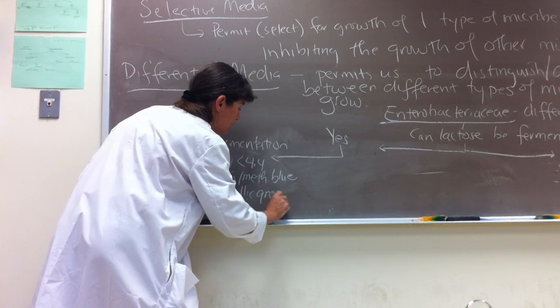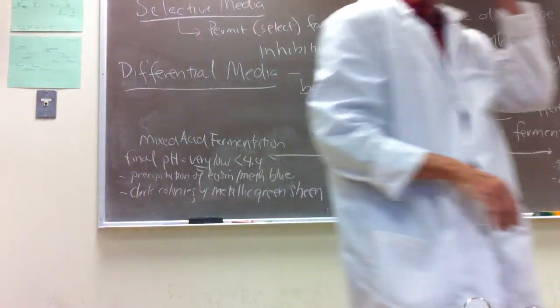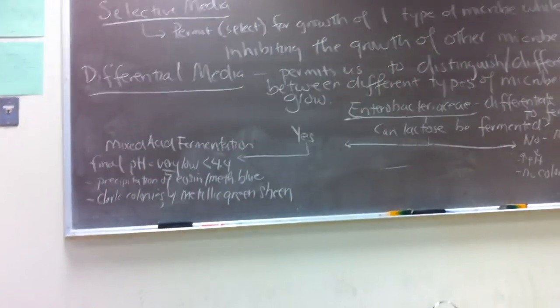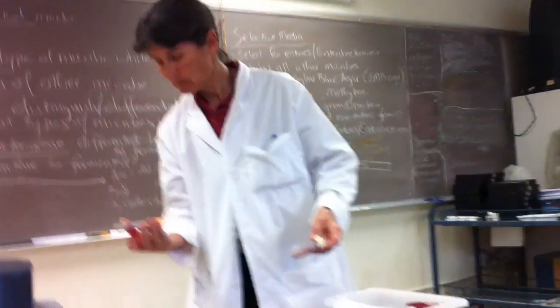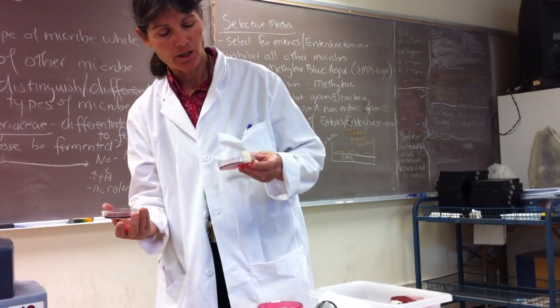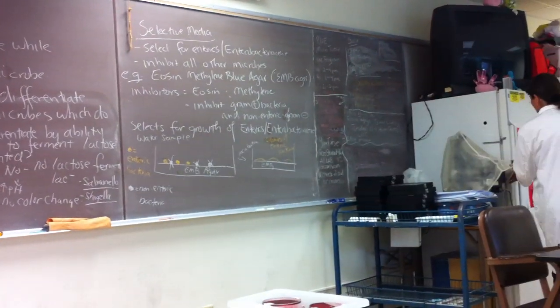Okay, now, before we keep going, let me pass out some of these plates that hopefully... I think we're starting to lose our metallic green sheen. That's a shame. Okay, let me get this other set of plates.